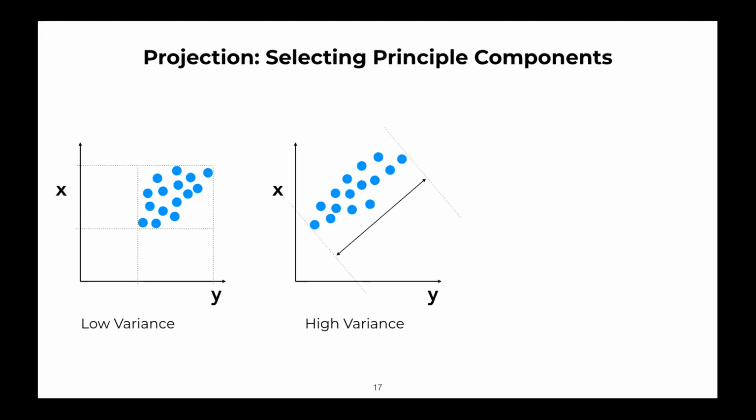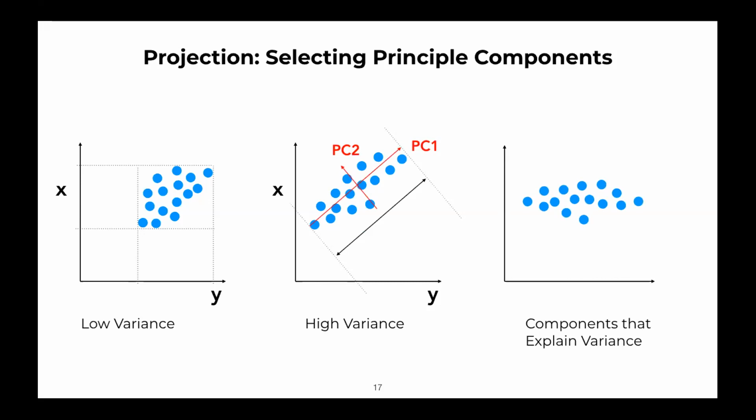So in principal component analysis, what we do is that we try to find out the variance between the data, so how they are different, and then we plot it using a mathematical model, which we will be discussing more and more in the machine learning class. So we use vectors and we plot them in a two-dimensional graph to understand the variance. So components which are generated through PCA are plotted to explain the variance, and we will be doing that in our hands-on exercise today as well.